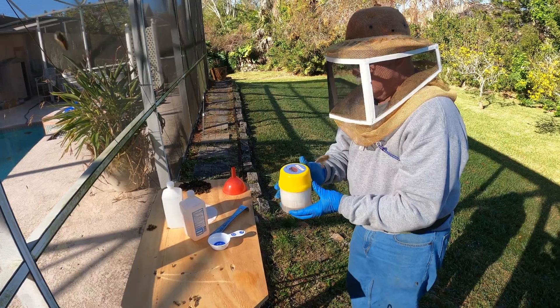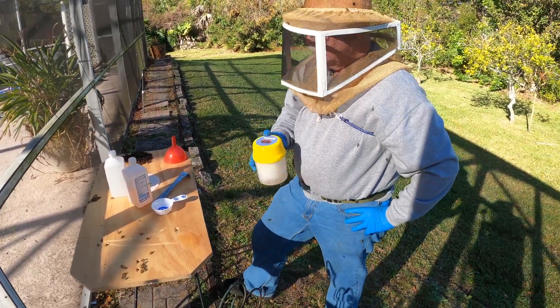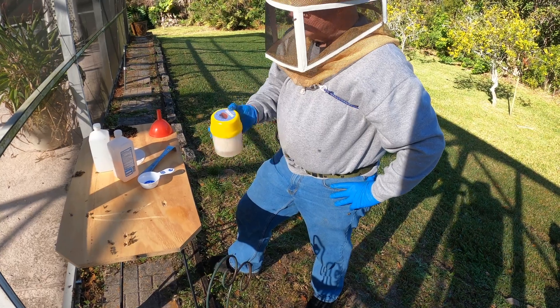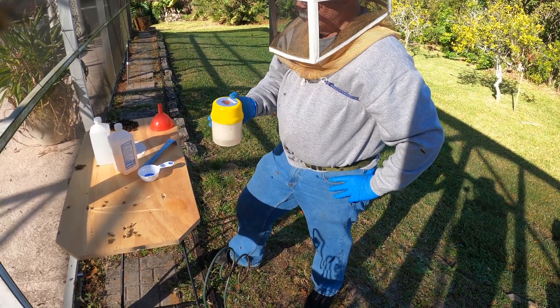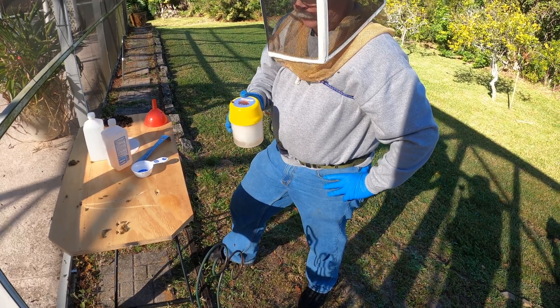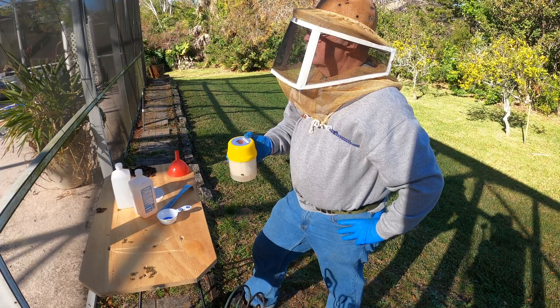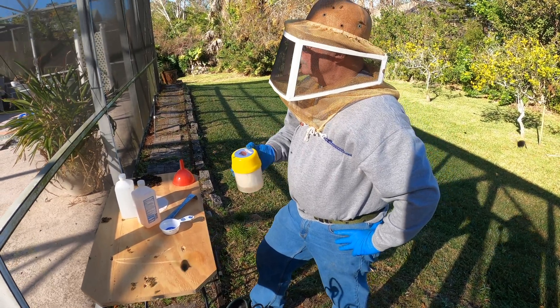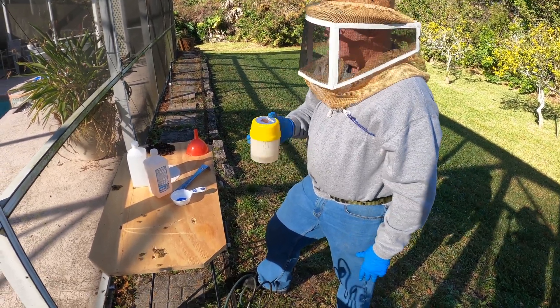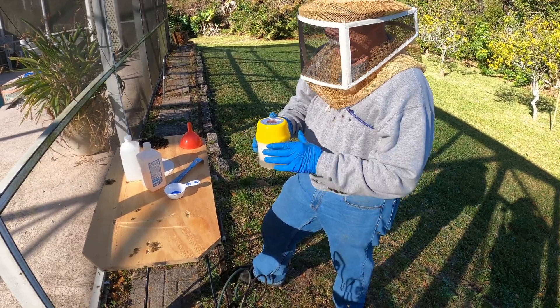Now you shake the alcohol wash jar for a good minute — even two minutes is good. I like to swirl it, but it has to be vigorous enough to actually dislodge the mites right off the bees. The sad part about doing an alcohol wash is that you're going to sacrifice 300 bees for the cause, but this is crucial — it is a good thing to do.